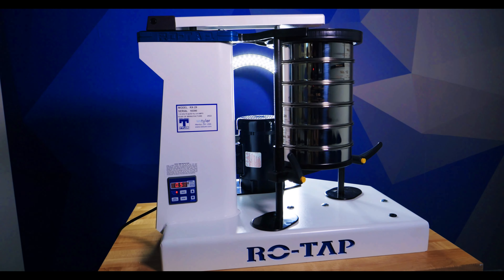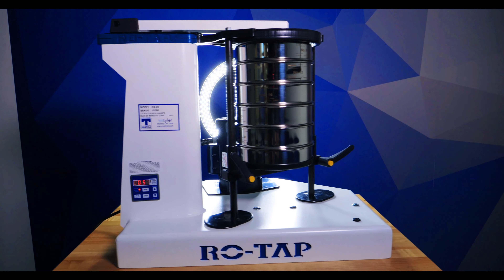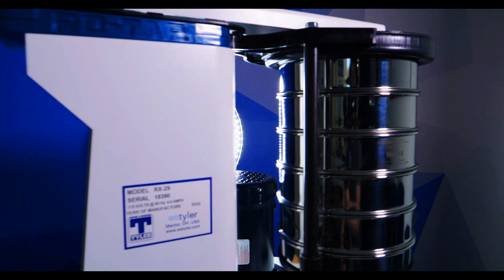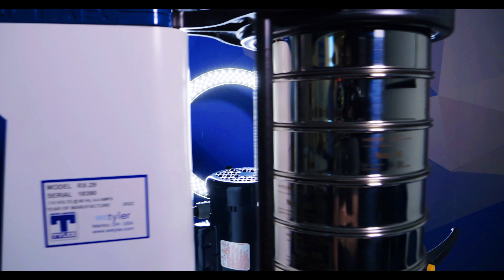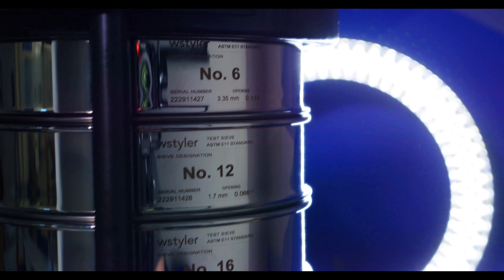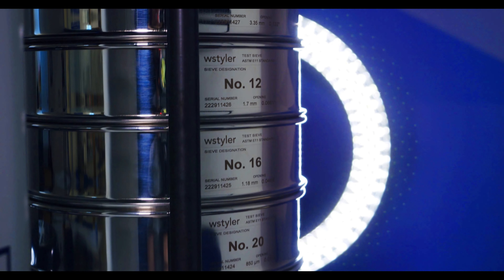Mechanical sieve shakers are designed for use in a wide range of industries to test and separate particles. Several attachments can be added to expand their capabilities. Mechanical sieve shakers can sieve pretty much any material you need — wet, dry, large or small, down to 20 microns. This is all dependent on the sieves that you use in your shaker. Having said that, the finer the particle, the harder it will be to yield accurate sieve results with a mechanical sieve shaker.